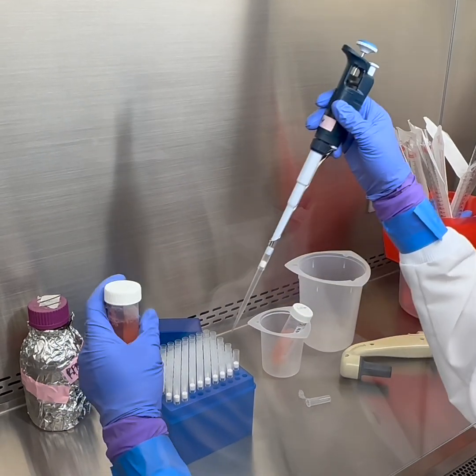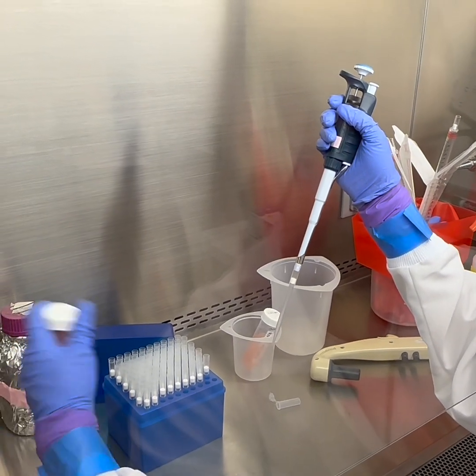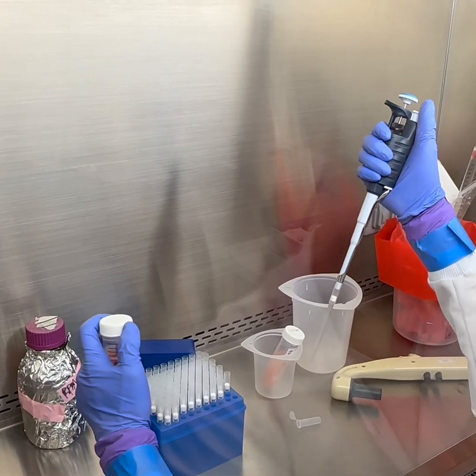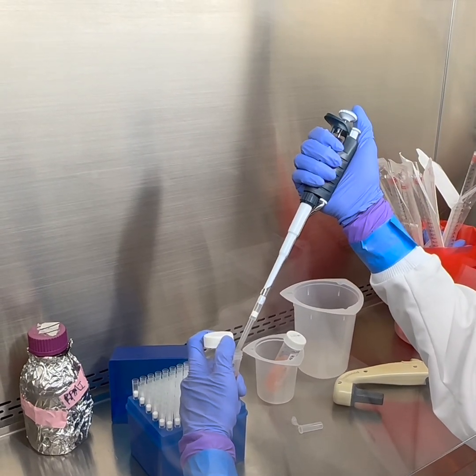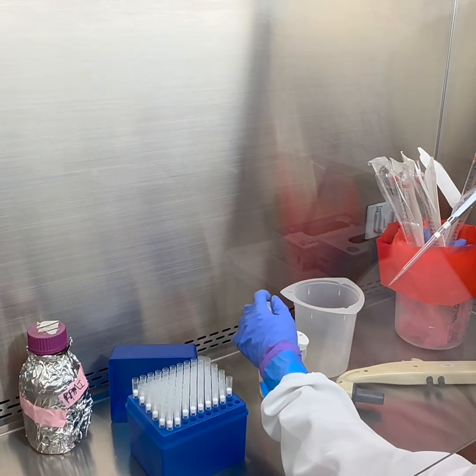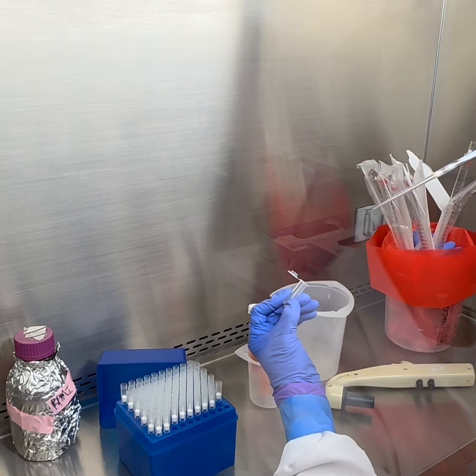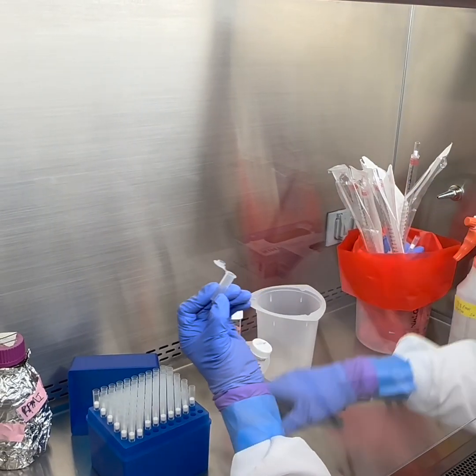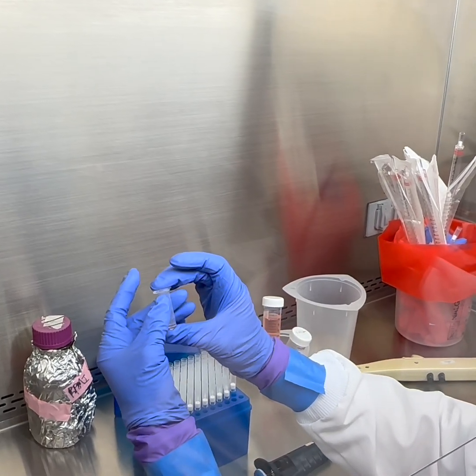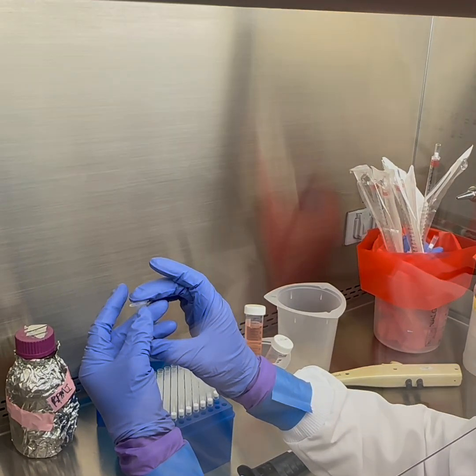And I'm just going to grab an aliquot, because I get paranoid that it's not mixed well enough. Close this. We're going to make a 1 to 2 dilution and then count again, and then hopefully we're at our target concentration, and then we will seed our plates.